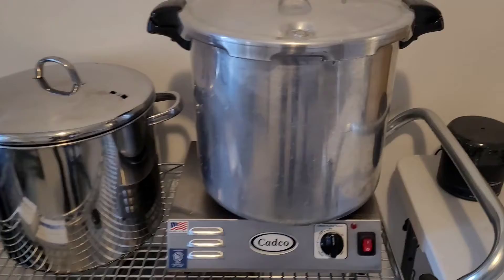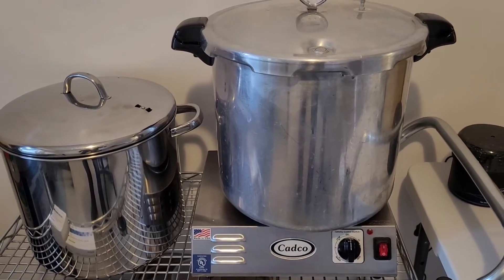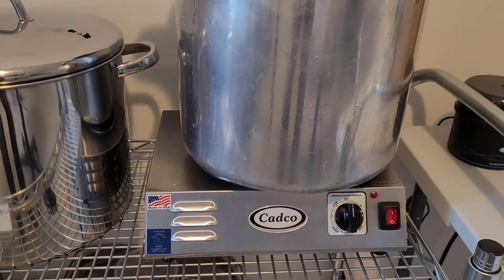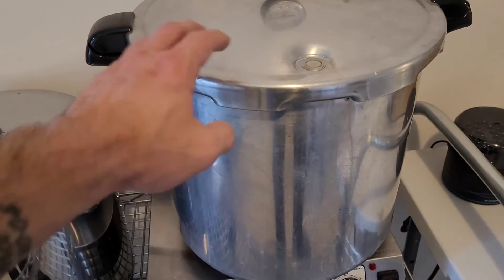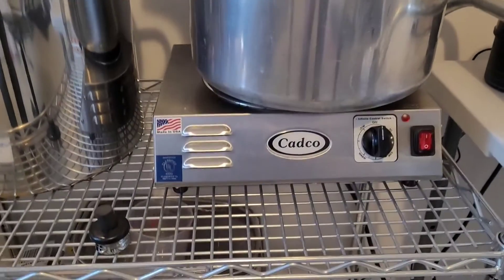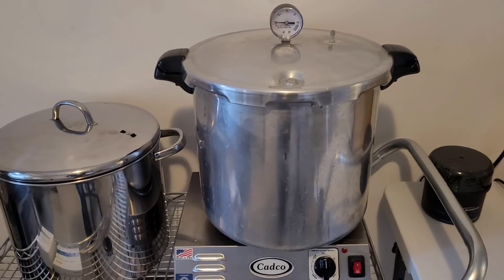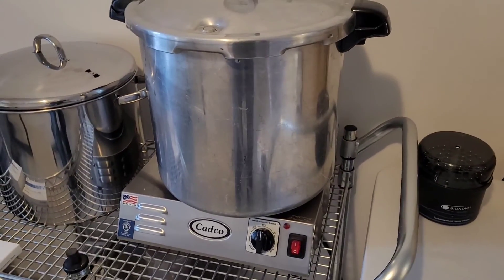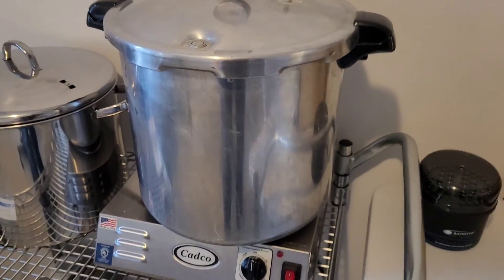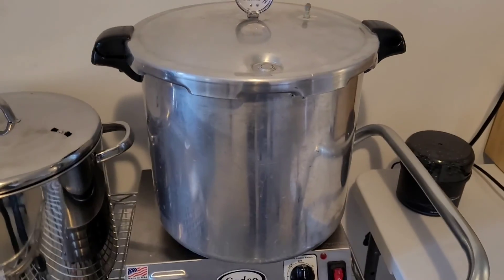A note on heat source: I'm using a Cadco electric burner. If you go the electric route and use a cheap Walmart or Canadian Tire electric burner, there's not going to be enough output to efficiently heat up a pressure cooker of this size, especially if the hot plate is a glass top. If you're using propane or a gas burner, you're going to want to follow the manufacturer's directions in terms of BTU, because if it is too high, the excess heat will cause rapid heat up which will burst your bags and potentially melt them if it continues to get too hot inside your pressure cooker. So keep that in mind.